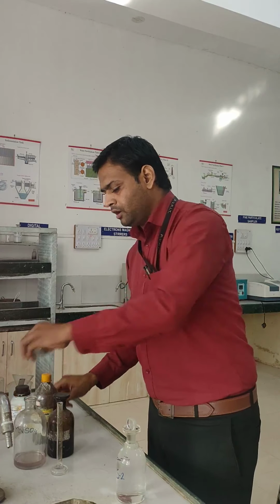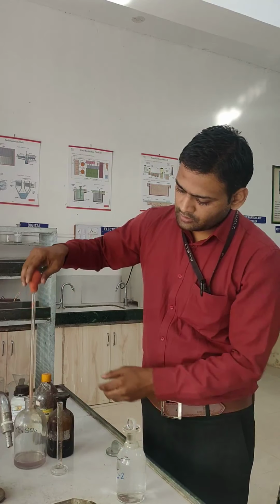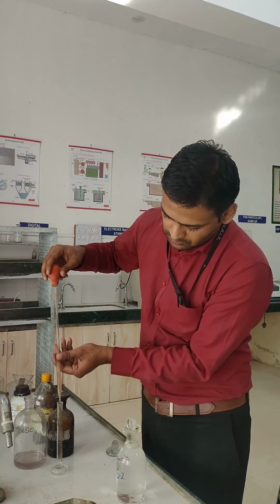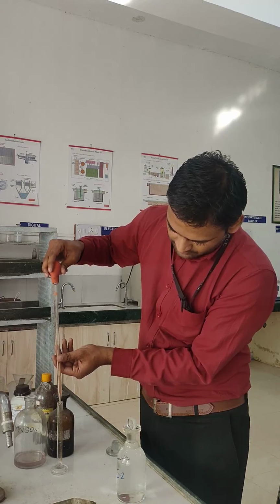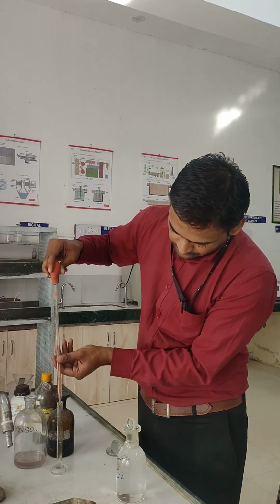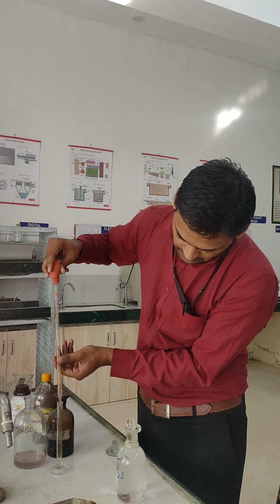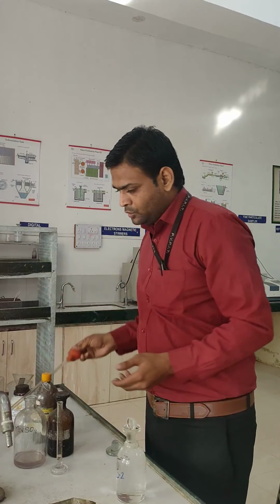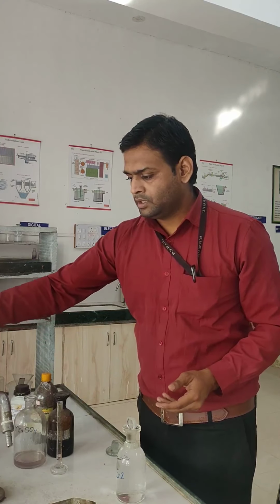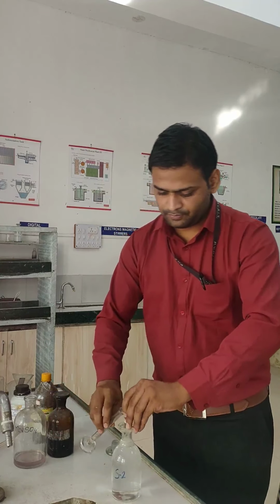Add 2 ml of MnSO4 first into this BOD bottle.